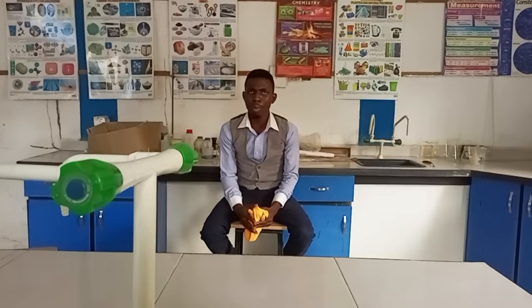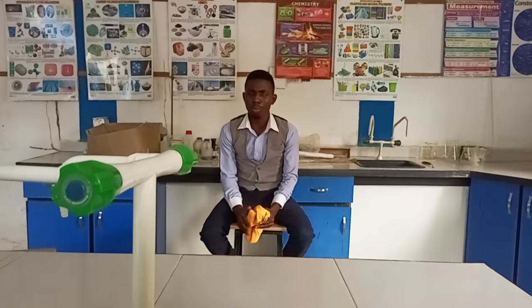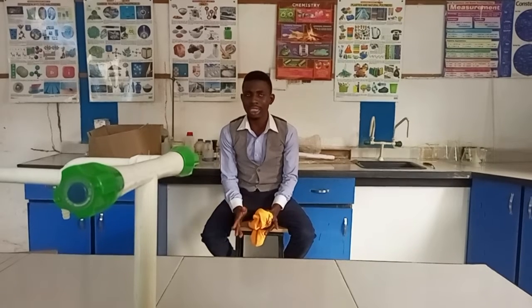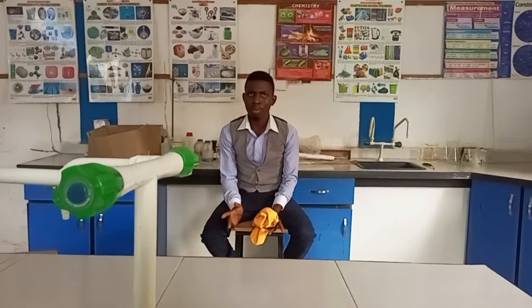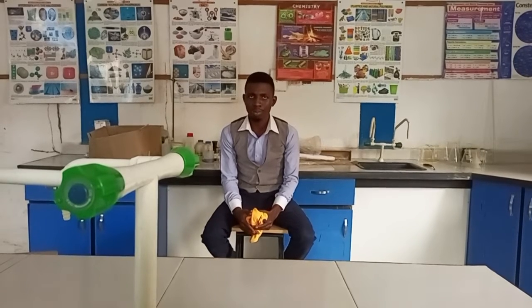Now, for example, if in the question you have been given a strong acid titrated against a weak base, in that experiment, what are you expected to use? Methyl orange. Methyl orange is suitable when you have a strong acid titrating against a weak base.